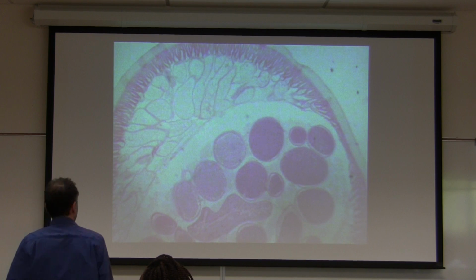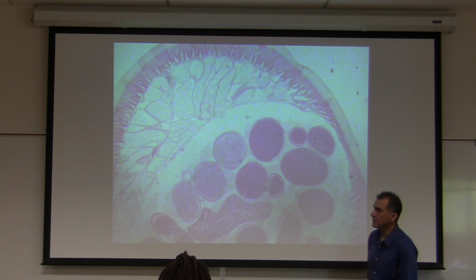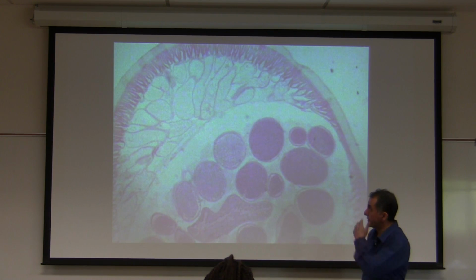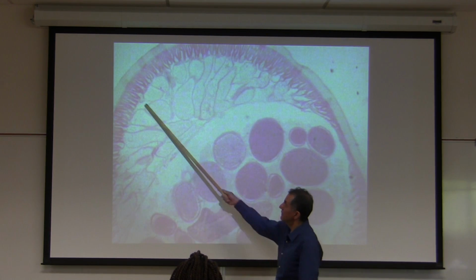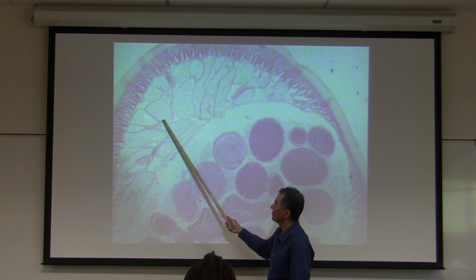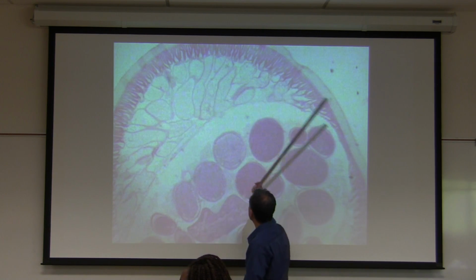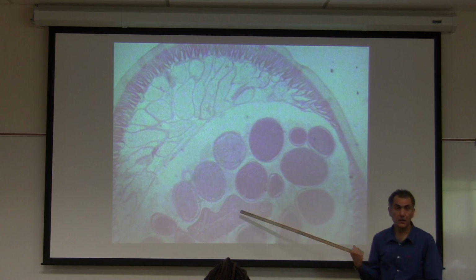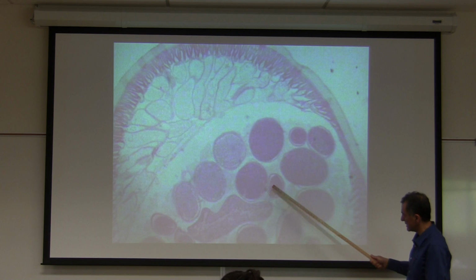Typical question from this slide is, what is the name of the organism? Ascaris lumbricoides. What phylum? Nematode. Okay, nematode. What is the name of structure? All of this. Longitudinal muscle. Even these are longitudinal muscles. What is the name of structure right here? Hypodermis. Determine the gender. Male. What is the name of structure? Testes. These are testes.